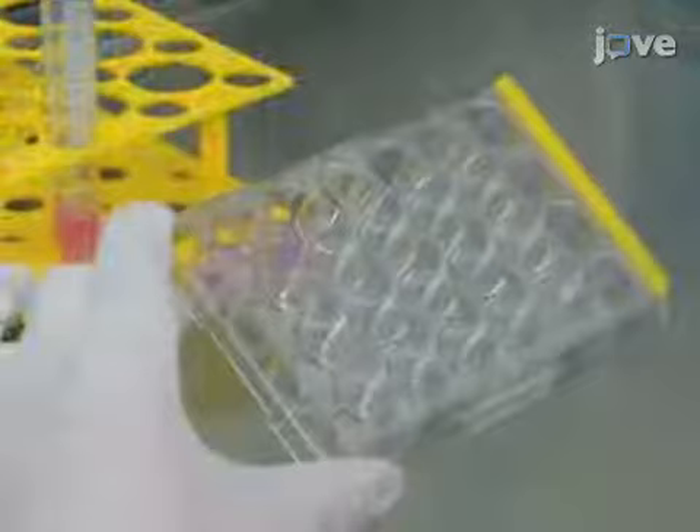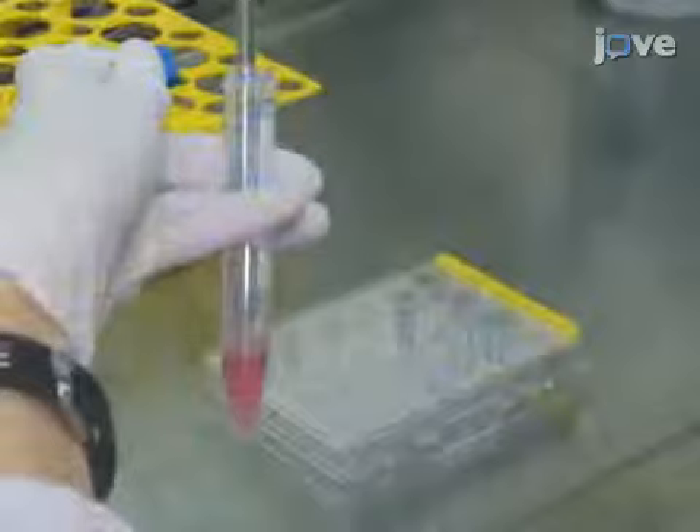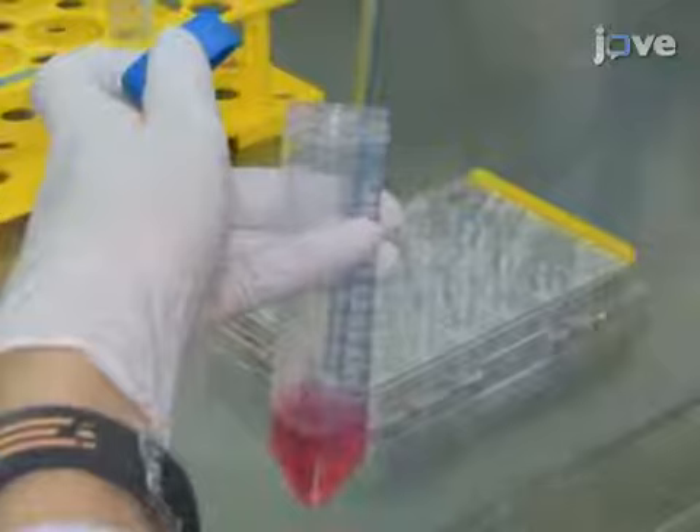Remove the medium from the well of a 24-well plate containing a sterilized glass coverslip and seed approximately 100,000 cells into the well. Use complete medium to top up the volume of the well to 0.5 milliliters. Then incubate the plate at 37 degrees Celsius with 5% carbon dioxide.